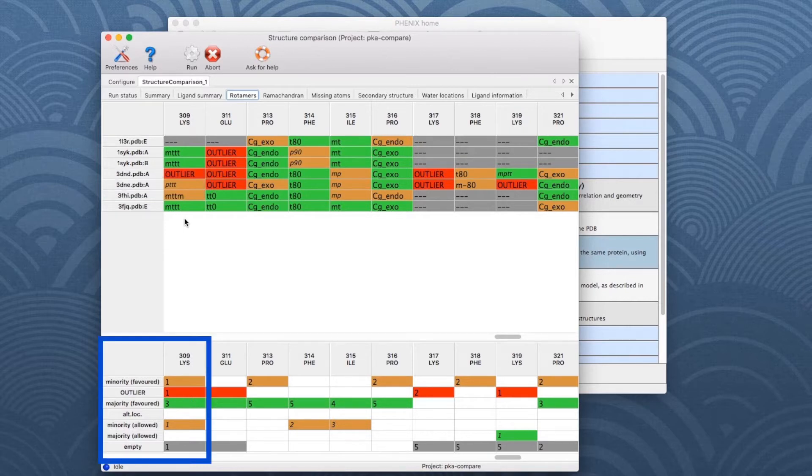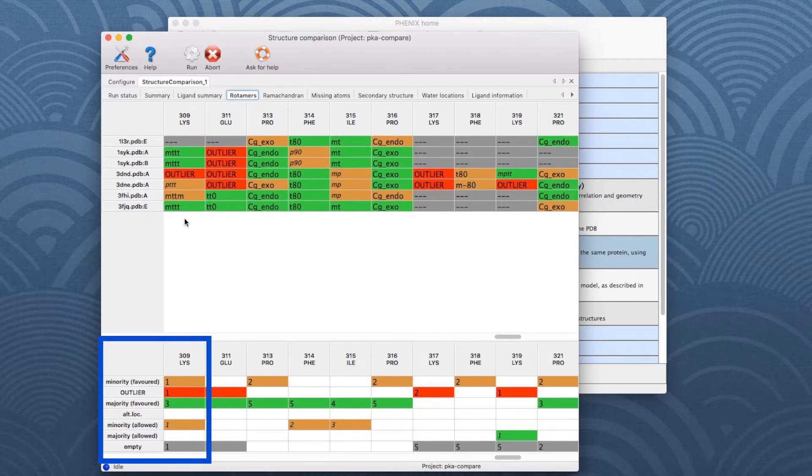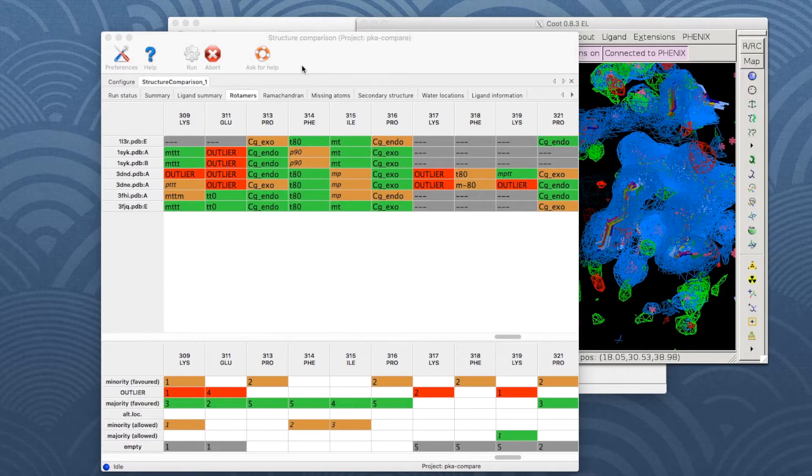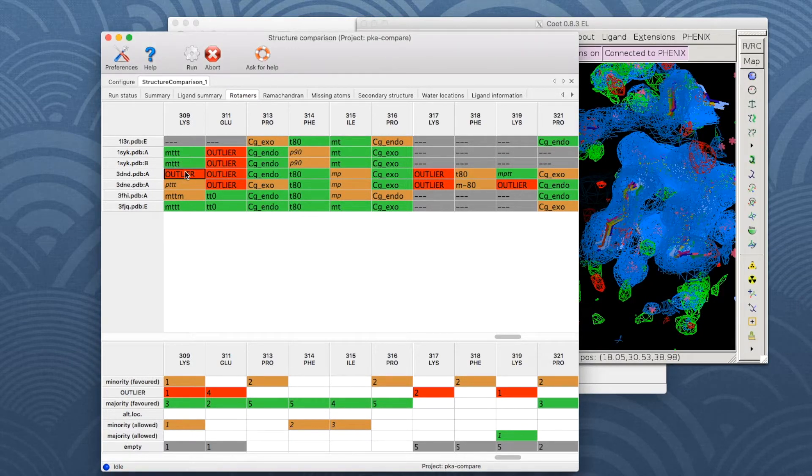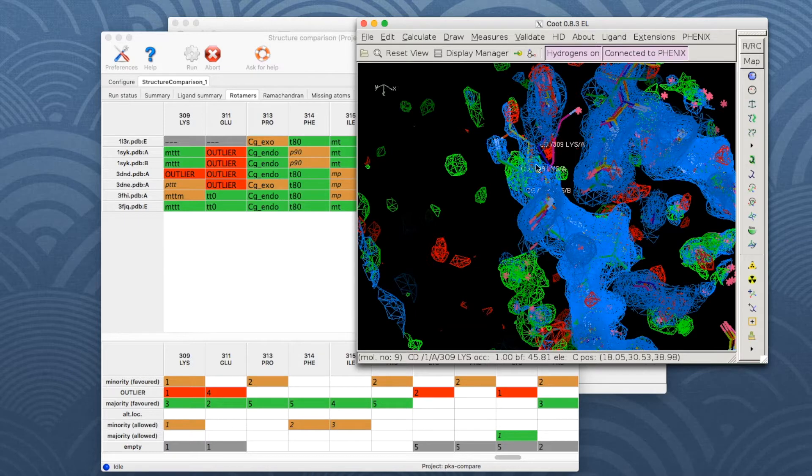The summary table below can serve as a legend for the cell colors. For lysine 309, there is 1 outlier, 3 favored rotamers, 1 minority favored and 1 minority allowed rotamer, and 1 residue has missing atoms. Now double click on the cell marked outlier, which will center on this residue in the COOT window.